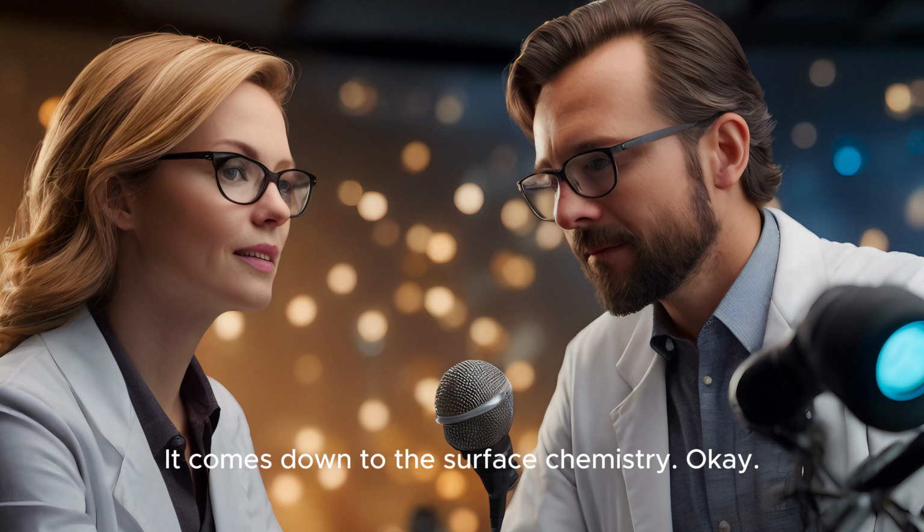It comes down to the surface chemistry. The carbon-clad zirconia has this unique surface that allows it to interact with the polystyrene molecules in a much more nuanced way. It's not just about size anymore, but also about the specific arrangement of those styrene units. The tacticity and chirality we talked about earlier. So the carbon-clad zirconia is like a molecular detective, able to pick up on those tiny clues that the C18 misses. Exactly. Sweeney, Wong, and Shalliker found that this column could even separate isomers that have the same number of styrene units, but with those units arranged differently. Wow, that's some serious separation power.